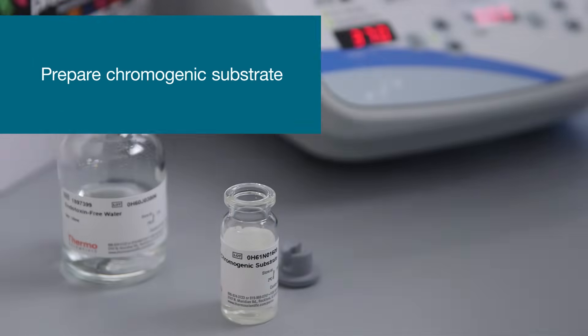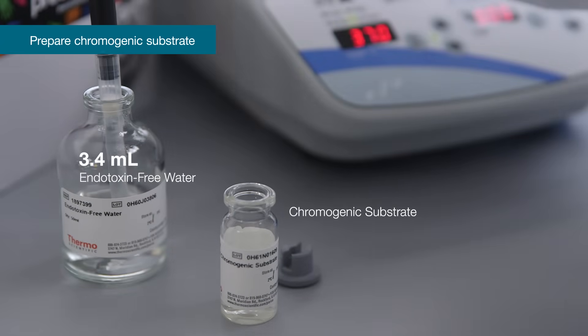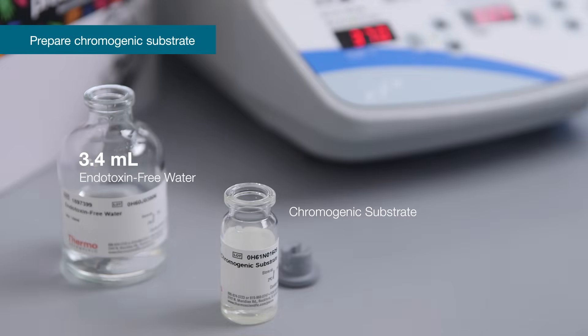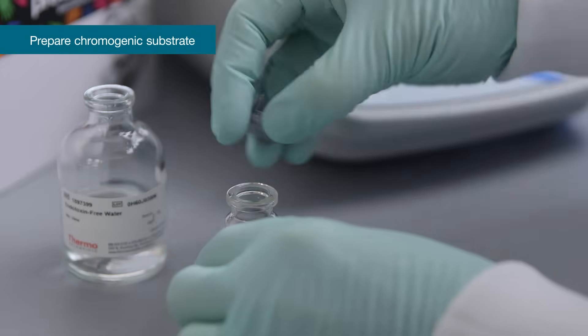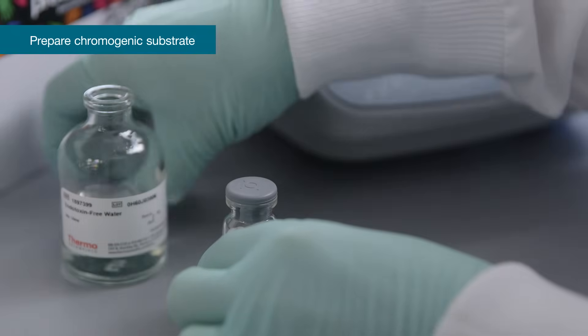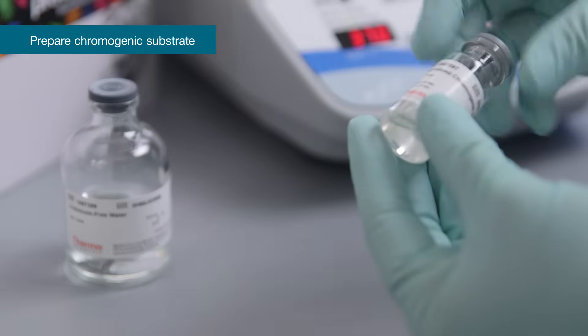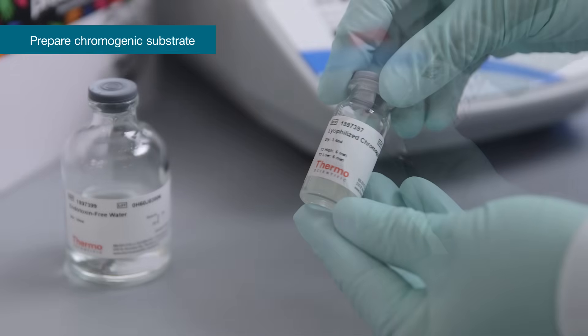Seven minutes before the end of time T1, reconstitute the chromogenic substrate with 3.4 ml of endotoxin-free water. Mix gently by tilting and swirling the vial. If more than one vial is required, pool two or more vials before use. Pre-warm the reconstituted chromogenic substrate to 37 degrees Celsius for 5 minutes before dispensing into plate wells.